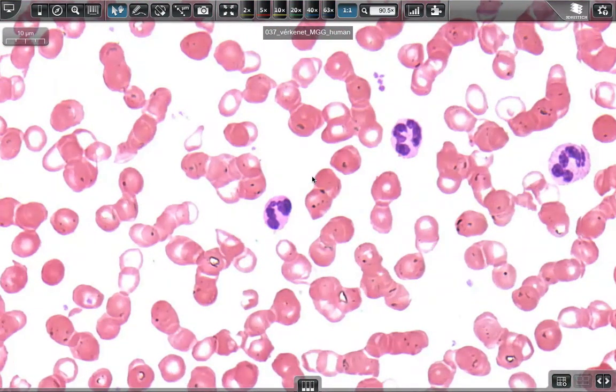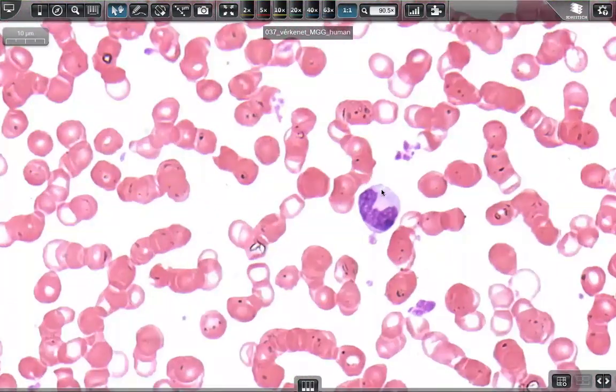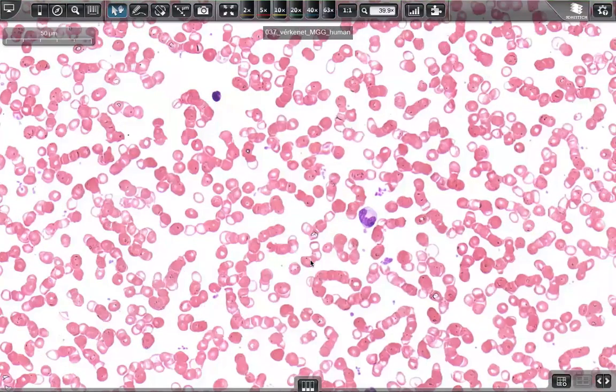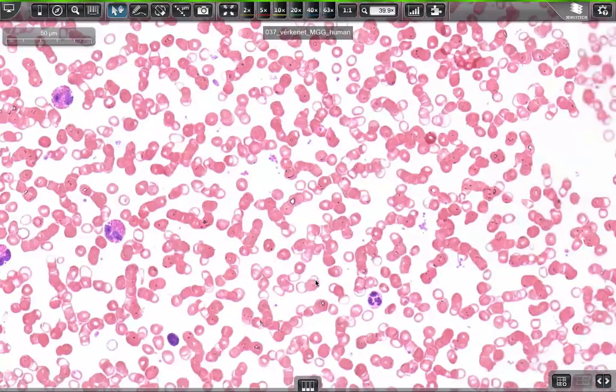Platelets. Now that's nice. This is a bean shape, that's the monocyte. You know, finding a basophil is a really hard job because it represents just 1% of the population of cellular elements. So eosinophil, neutrophil.